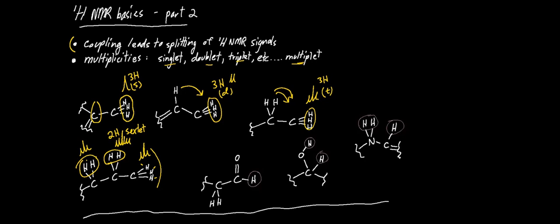Now there's a few exceptions. Aldehyde protons, like you see here, are often not split, almost never split, in fact. The carbonyl forms some sort of barrier to coupling, even though you think it ought to split. OH and NH protons are sometimes split, sometimes not. They're usually broadened. And so with these two, it's sort of a case-by-case thing. Sometimes they are split, sometimes not. Often, I would say, not split.